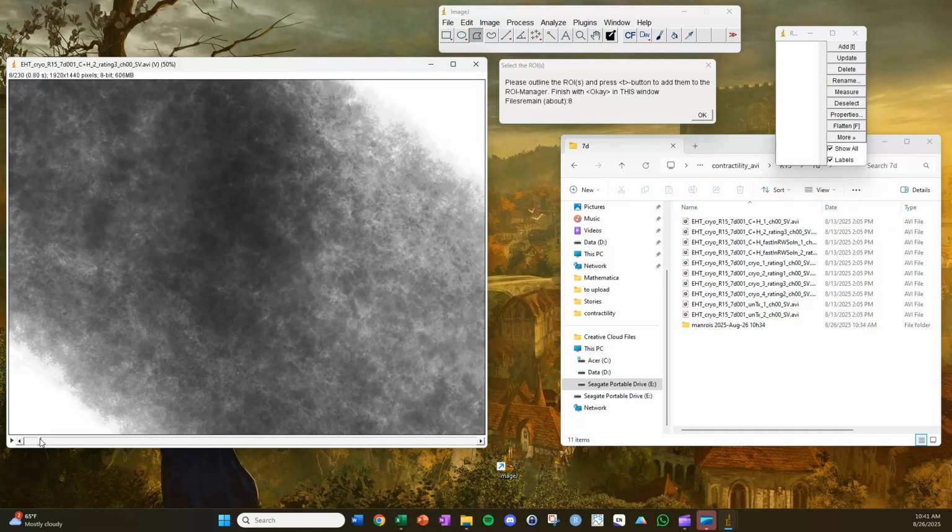Those are often the same, but since these videos are taken at the center of a tissue that's contracting both longitudinally against the posts and in the perpendicular direction, like inwards against itself, sometimes the contraction for these tissues does not necessarily correspond with the frame of lowest area. But at any rate, it looks like it's contracting inwards there. So I'll click here.